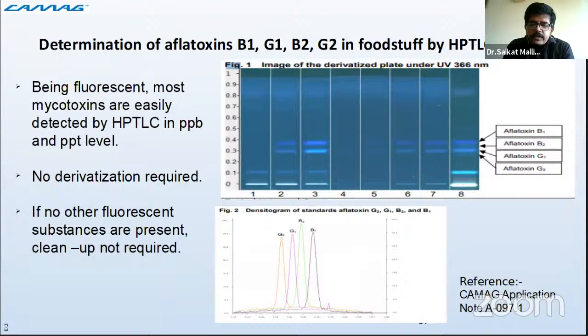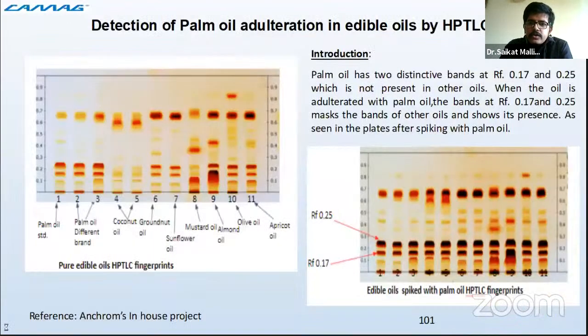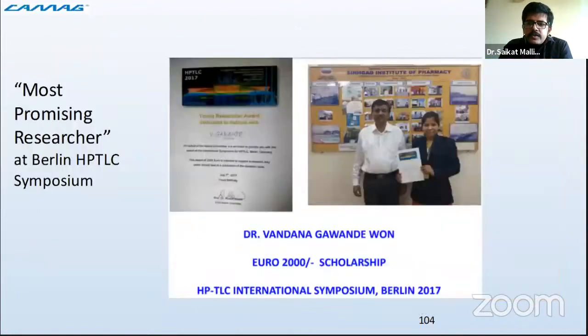Now we come to the food aspect. I'll just go ahead because we will not be going into it in detail. With this, I'll focus on showing you some videos to help you understand the entire HPTLC concept. Initially, we will see an entire analysis video, followed by some of the processes happening within HPTLC, which simplifies understanding of the processes. And finally, we'll take up questions.